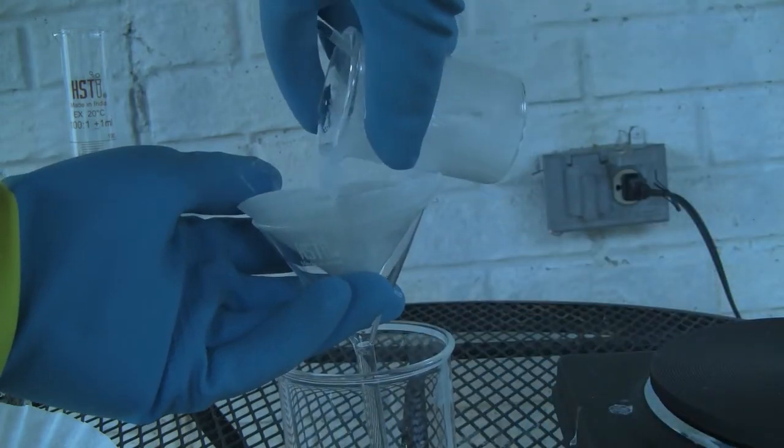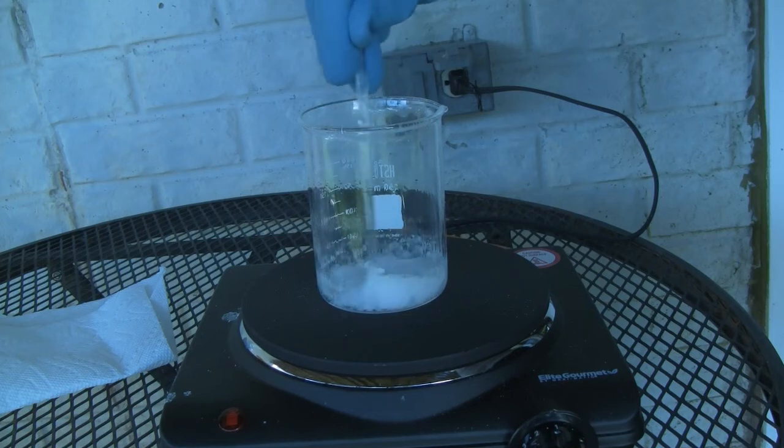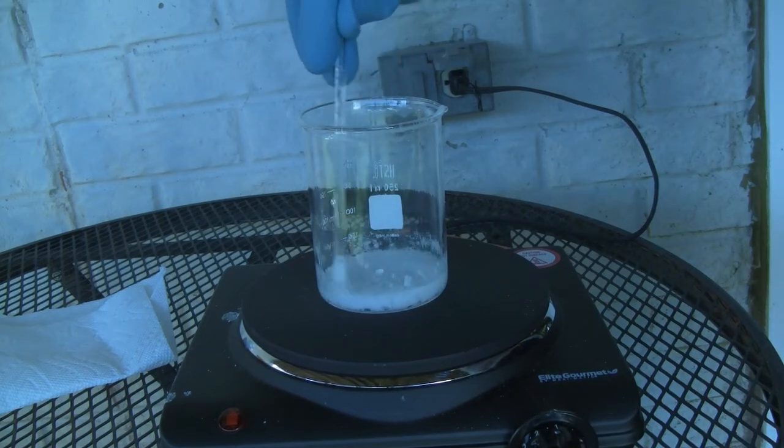After a few minutes of heating, the solution was then gravity filtered to remove any insoluble fillers. The acetone filtrate was then boiled off until white precipitate was formed.